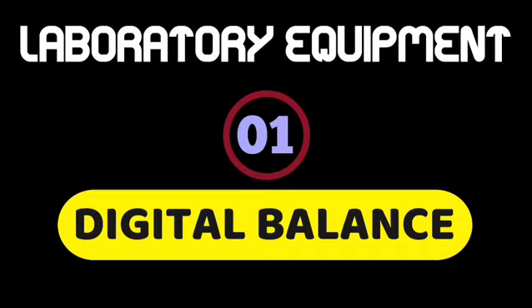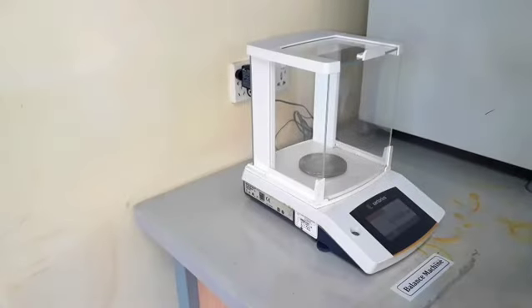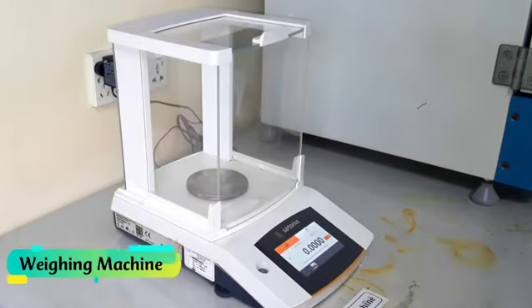The first one is the digital balance. A digital balance is used to measure substances with high accuracy. There are different types of digital balance, like analytical balance, precision balance, micro balance, and ultra micro balance.